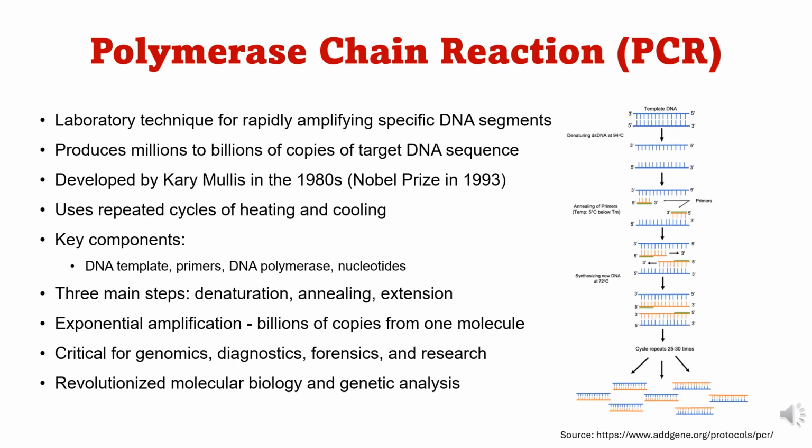Well, polymerase chain reaction is a revolutionary laboratory technique which has transformed molecular biology and genetic analysis since its development by Kary Mullis in the 1980s. This is a powerful method for rapidly amplifying specific DNA segments, producing millions to billions of copies from a single molecule. PCR utilizes repeated cycles of heating and cooling to exponentially replicate target DNA sequences.